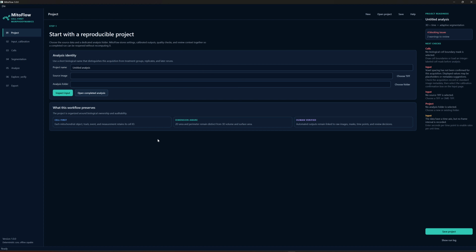I'll just call it test, and then source video. Like I mentioned, I'm going to use the MitoTNT's source video, which I have here, instead of the MitoFlows, which is my own image. I'm going to use the MitoTNT's image. And then I'll create a new folder called YouTube just to keep everything contained. That is now going to be the analysis output folder.